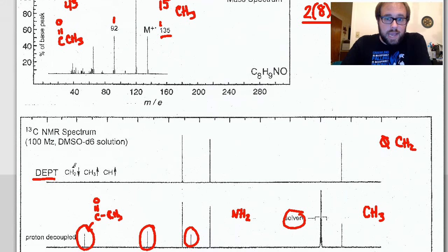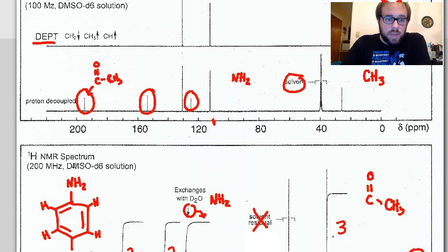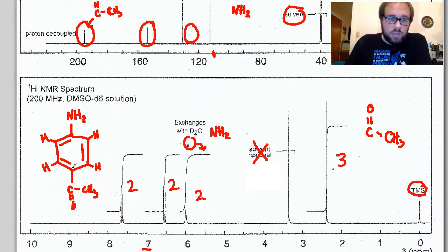Yes, because it's C8H9NO. So let's knock out the nitrogen and the oxygen. The nitrogen comes from the amine, and then the oxygen comes from the carbonyl. So those are both accounted for. Now the last thing we need is 9 hydrogens. We get 4 on the aromatic ring. We pick up an additional 2 from the aniline or the amine group up here. So that's a total of 6. And then you add an additional 3 for that methyl group. That is 9. This structure is valid.